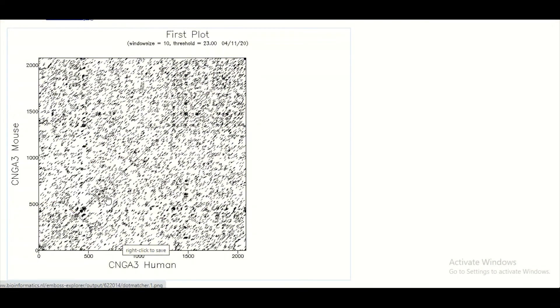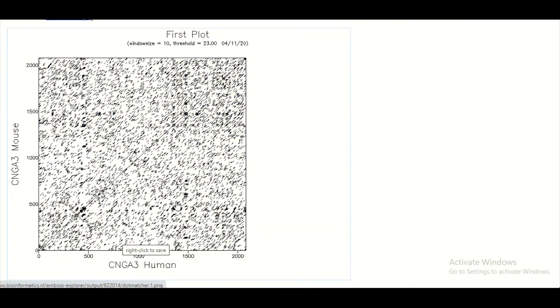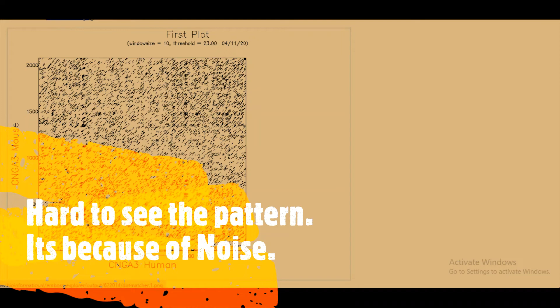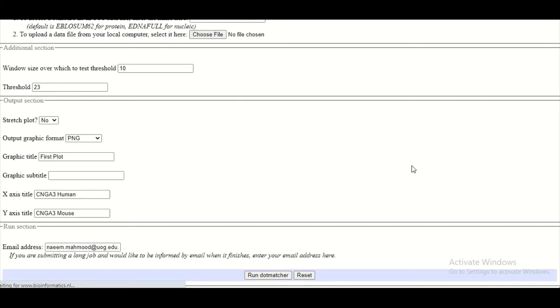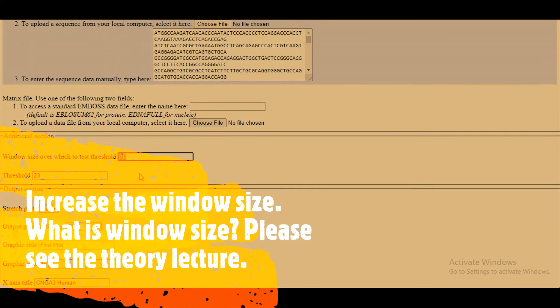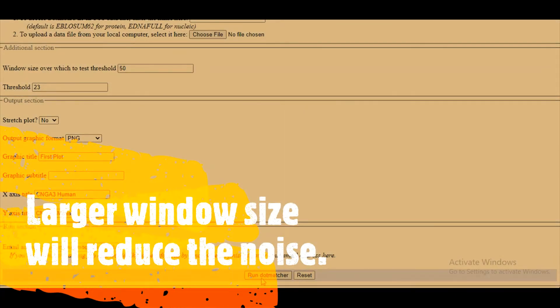Along with that central diagonal line, there are many small diagonal lines parallel to the central diagonal line also appearing. But it is very confusing to understand the meaning of these parallel diagonal lines — it means there is a lot of noise on my graph and there is a need to reduce the noise. To reduce the noise, we are going to move back to the dot matcher page and this time we are going to set the window size. Previously we set the window size of 10 but this time we are going to set the window size of 50, and when we increase the window size the magic is going to happen.